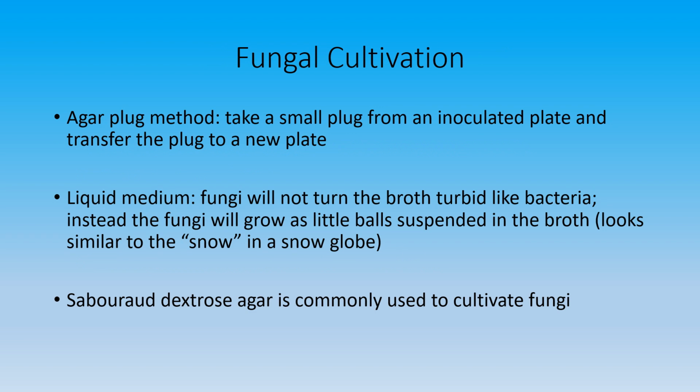So how do you grow the fungi in a lab? There's different ways of doing this. If you are growing them on a solid media, typically you would grow them on a petri dish, not in a test tube. What you do is from your original stock plate, you would take a little plug, and then you transfer that plug to a new plate, and then the fungi will grow from that.